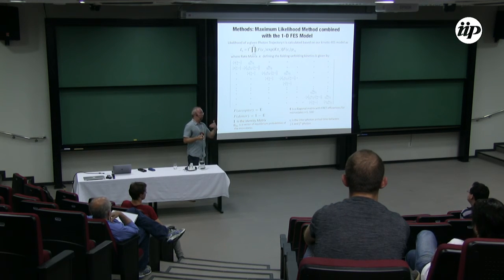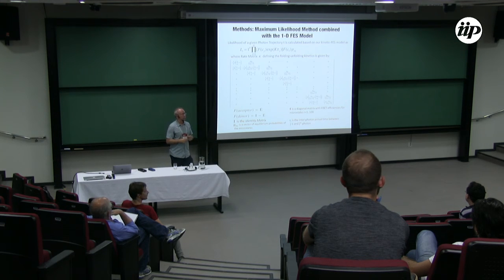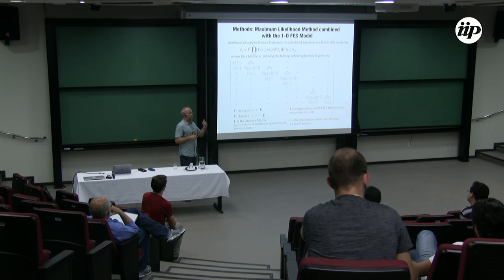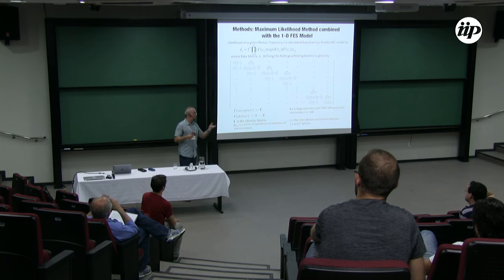So basically, when we try to reproduce the surface from these maximum likelihood state trajectories, what we see is that the barrier is fine. It's just the minima are much sharper. Which is kind of counterintuitive because you would think that it should be the other way around. But I think it's just because, since you are always enforcing the most possible trajectory, it normally tends to be one of the shortest ones, right?